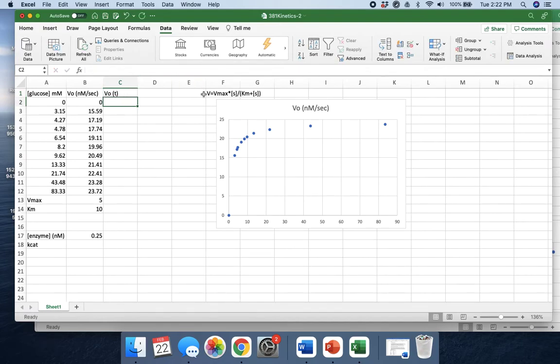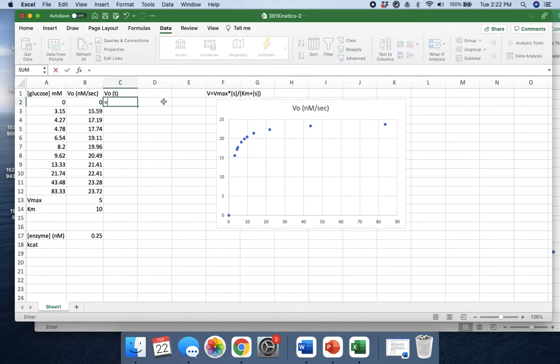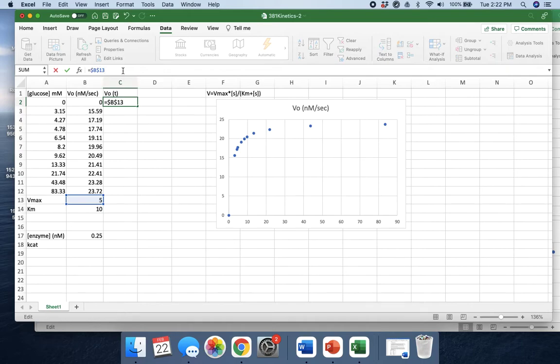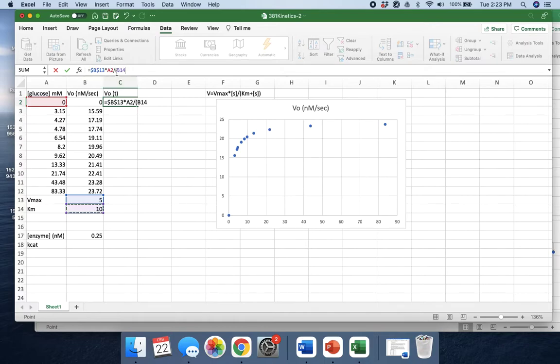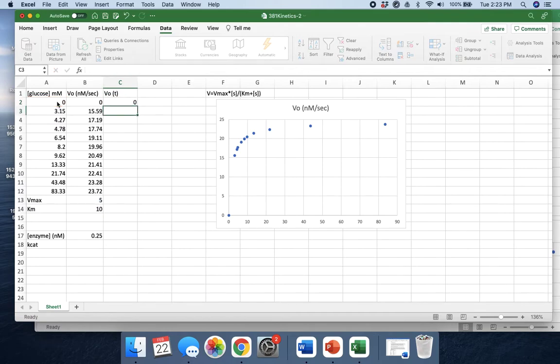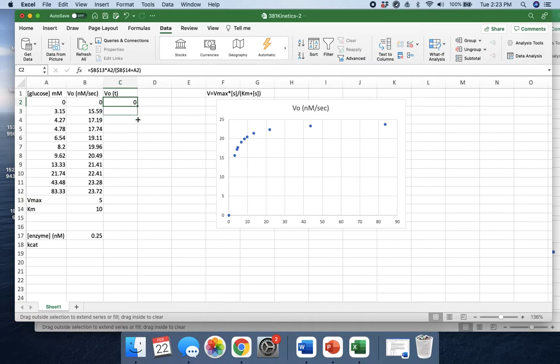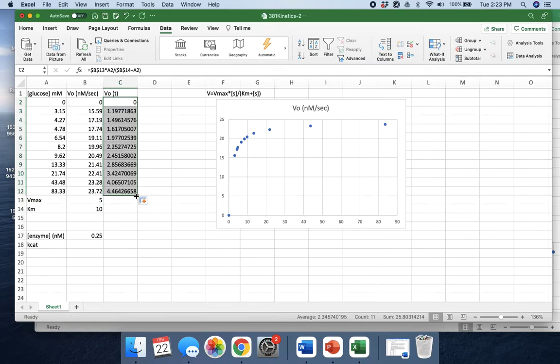Our V0, which is the V in this Michaelis-Menten equation, is going to be equal to our theoretical Vmax, and we'll put dollar signs to lock that in place, times the substrate concentration divided by the Km. Let's lock that in place again, plus the substrate concentration. There's our Michaelis-Menten equation. Now I'm going to put my cursor in the lower right-hand corner of this cell and propagate it down throughout the whole data sheet.